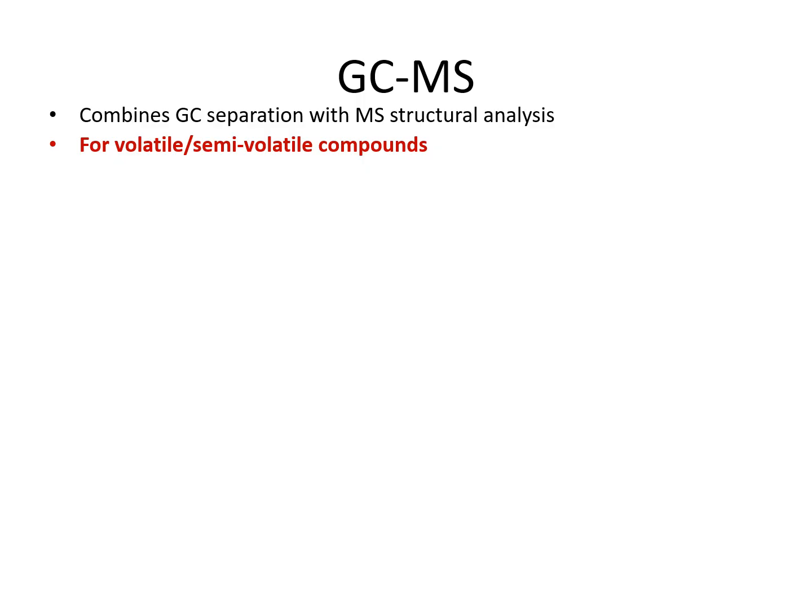Hence, a gas serves as a mobile phase that carries the samples, and the samples are also volatilized into gaseous form, and then they are passed through the column by the carrier gas for the separation to take place.